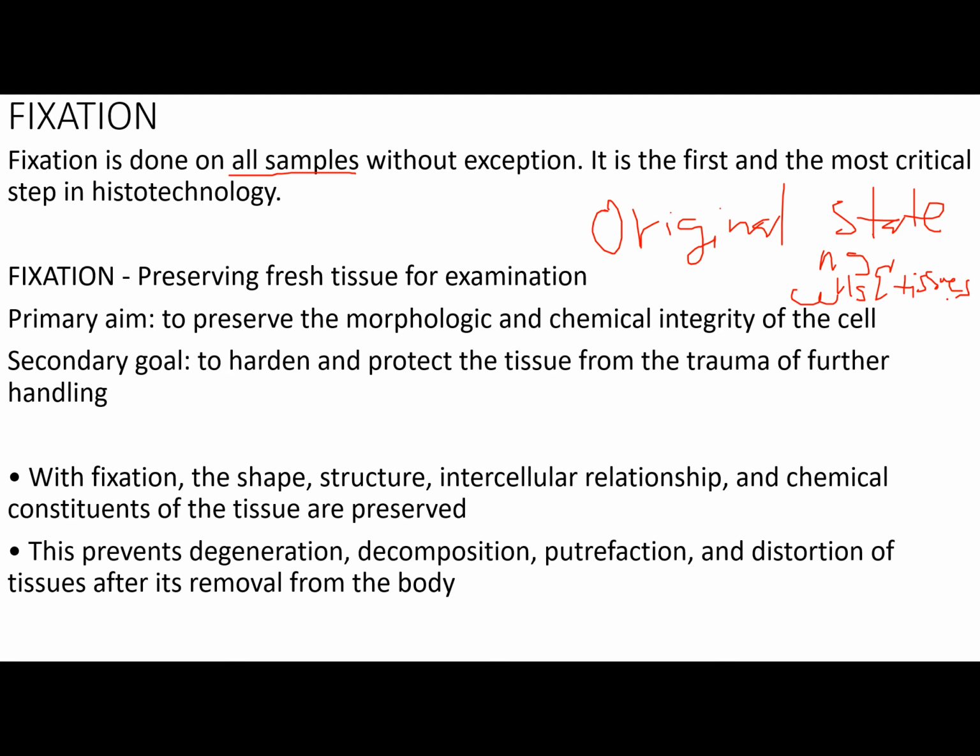Kasi kung hindi mo gagawin yun, let's say hindi ka nag-fix, na bulok yung sample, pag binasa ng pathologist yan, mamaya isipin niya may cancer pala yung patient, pero hindi naman. Ang problema lang, ang nangyari lang, hindi lang na-preserve. So originally, normal talaga yung appearance ng cell, but because you did not do fixation, it caused the cells and the tissues to decompose, and the doctor or the pathologist would have a different diagnosis.